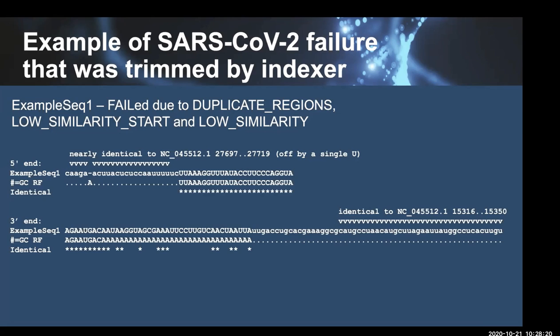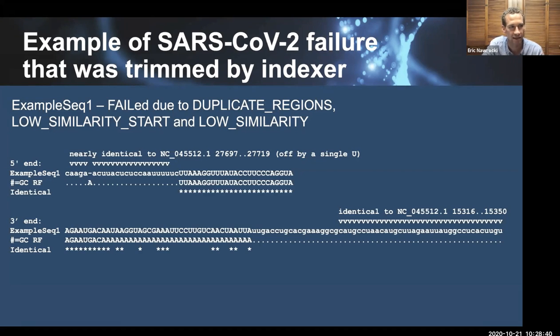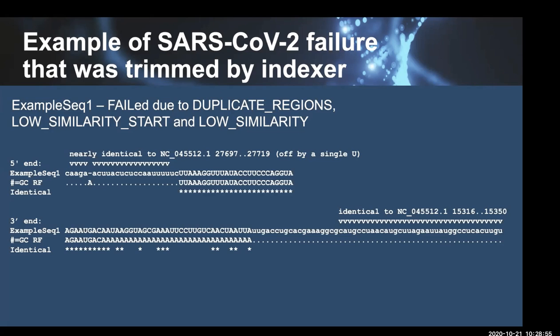Yes, I think I'm understanding that it's possible I have some noise in the table file locally, but the GenBank submission process would catch that. I believe that's right. There are additional steps that are done to go from the VADR output to the final files that go into GenBank. Linda Yankee can speak better to it than I can, so maybe we could bring that up with her, and you can also email us and give us a specific example and we can look at it. Thanks, I appreciate it. Sure, no problem.